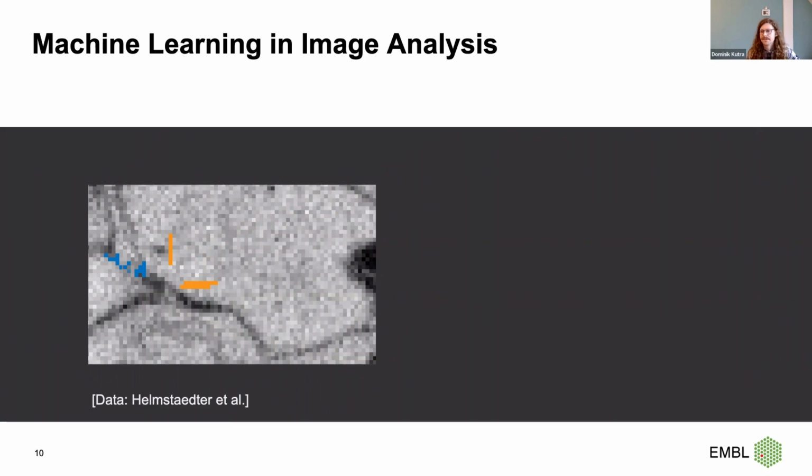And what we can do now is look at these numbers. I coded them here as gray level, but they are continuous numbers, as you've seen before. So we can look at those on an axis. And you can see that there's a tendency that these pixels I've marked with orange tend to have higher values, while the blue ones tend to have lower values. This could give you the idea, maybe I can separate those, right? But if we add some more annotations, we see, okay, there's quite some overlap. It will be really hard, by just taking one number along this gray level axis, to say they belong to one or the other class.